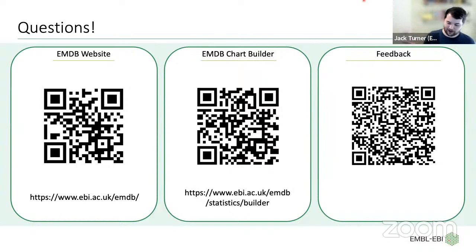There is a slight issue where different file formats can be in the same deposition, and we'll have to deal with that. But so far, because EMPIAR is non-mandatory and has mainly had very experienced EM scientists, and actually software developers as well, who know this information, we haven't really had that feedback, so haven't made the change. But as it's now opening up to more and more people depositing, we have noted that there are some rate limiting steps that are actually inhibitory to getting people to deposit, and we are looking at improving that and being able to scrape it directly from the file.